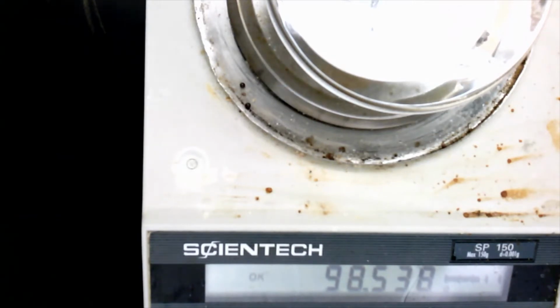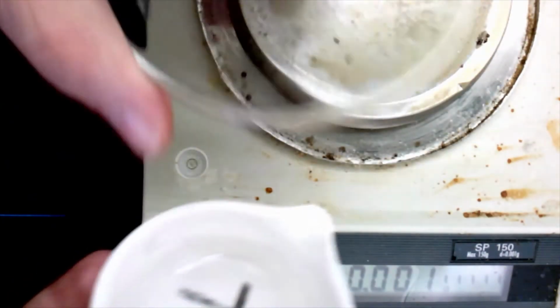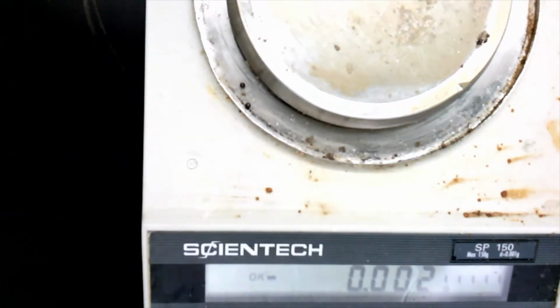The first thing you recorded was the dish and the watch glass. The second thing you recorded was the dish, the watch glass, and the magnesium itself. So if you subtract the first value you recorded from the second, that should give you the mass of just the magnesium all alone.